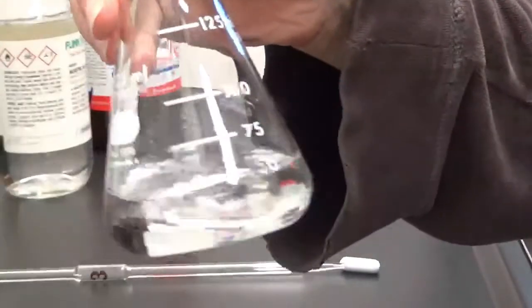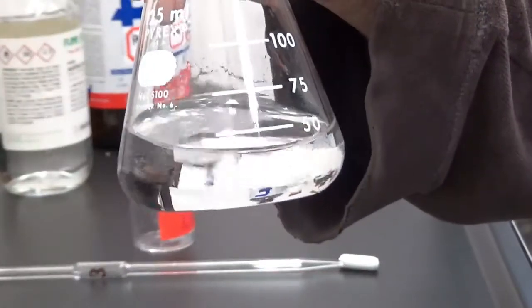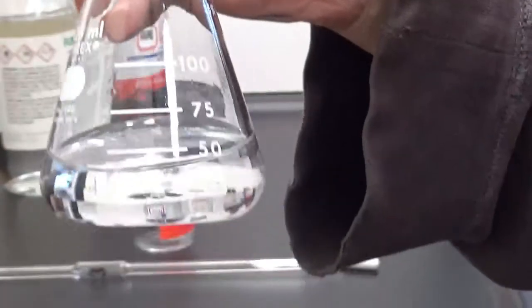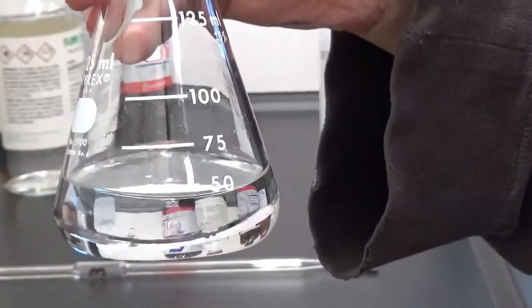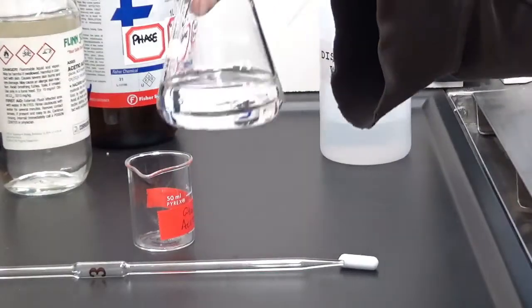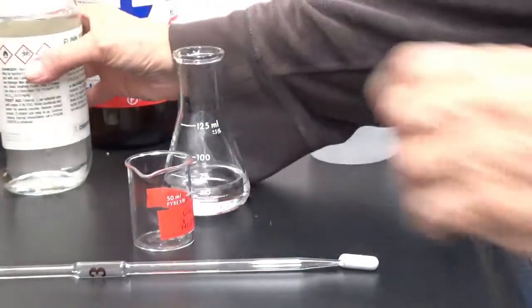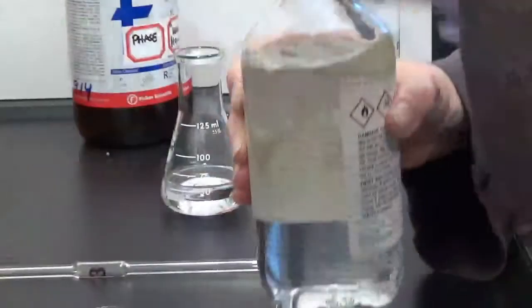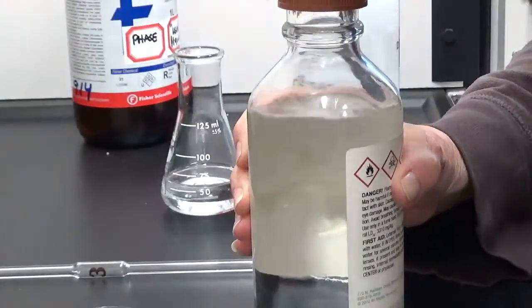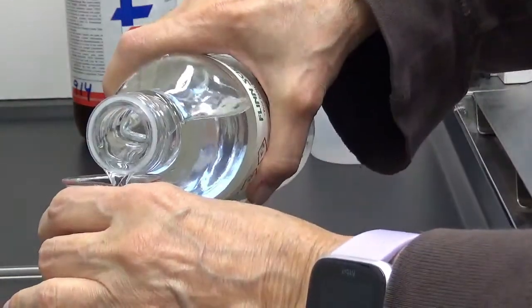So what I have here is a sample where I have pipetted 25 milliliters of butanol and 25 milliliters of water. And for part 4, I'm going to take some glacial acetic acid, a small amount, just 3 milliliters. So I'm just going to put a little bit in here.